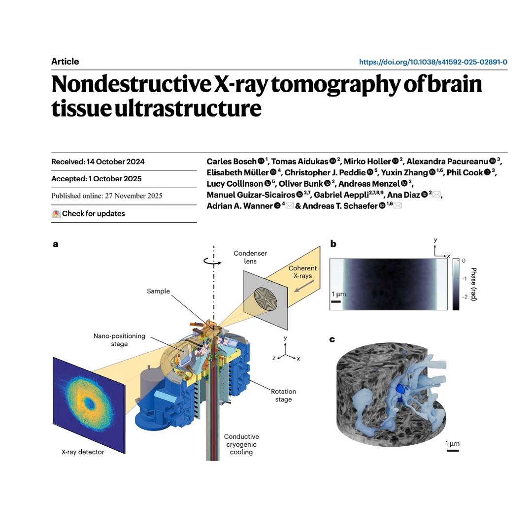I mean, think about it. If you can map the brain's full physical wiring and then go back and hit the exact same synapses with chemical markers to see their neurotransmitter profile, how does that revolutionize our understanding of diseases like Alzheimer's or Parkinson's, which are defined by both structural and chemical changes? That correlation between structure and function on the exact same physical specimen, that really is the ultimate frontier.